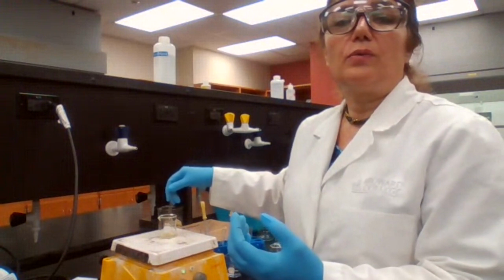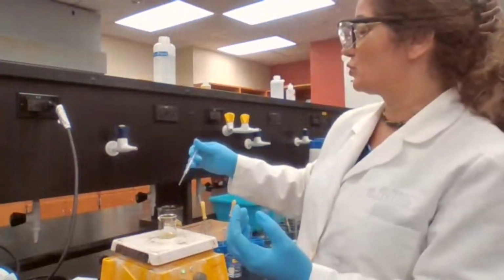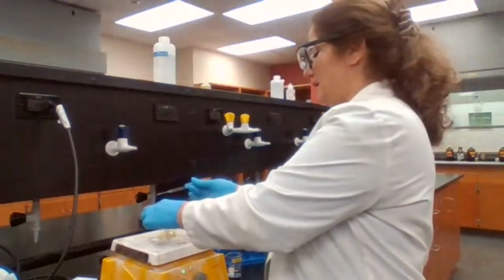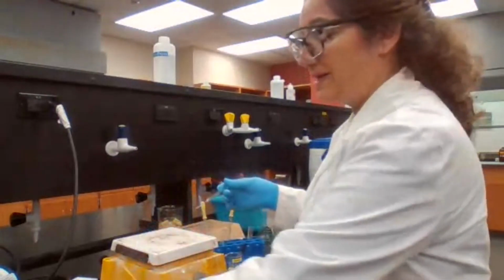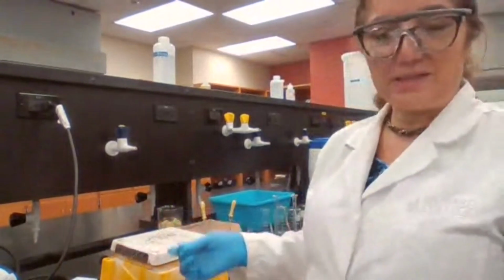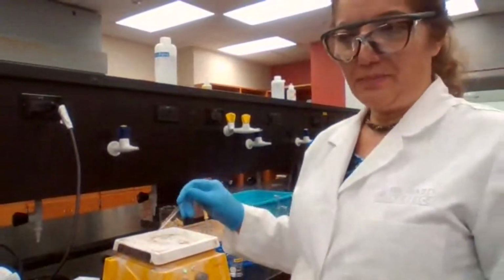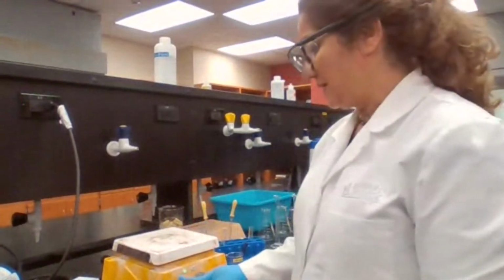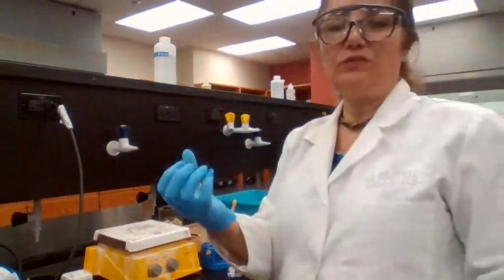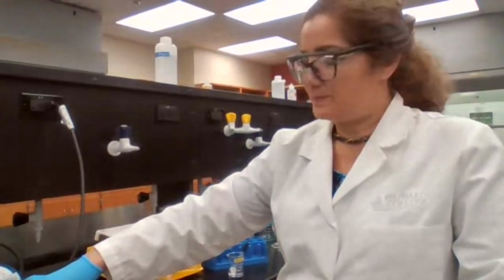So when the sample in the mixture reaches room temperature, or basically when you see some crystals forming, then you can place it in ice bath for complete recrystallization. Why ice bath? Because the lower the temperature, the lower the solubility. So when you place in ice, you lower the solubility for maximum recovery of your crystals.